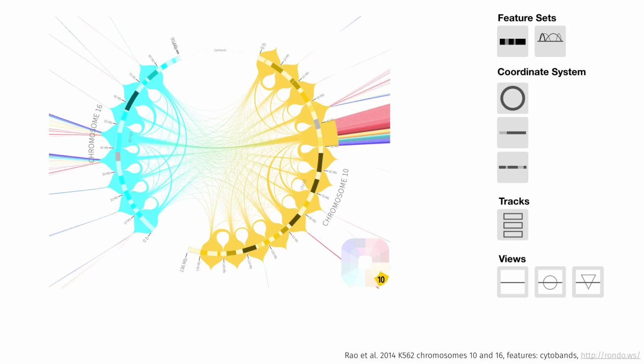And what this visualization shows us is essentially what parts have some sort of level of interaction. Here the colors just indicate what part of the sequence is somehow interacting with another part of the sequence. So there's a lot of interaction happening in this segment of the sequence. This is something that's very common. I mentioned this at the very beginning. We have short-range and long-range interaction. DNA is generally interacting a lot in the short range, like around a particular stretch of sequence, there will be a lot of interactions. That's why there are these blobs here.